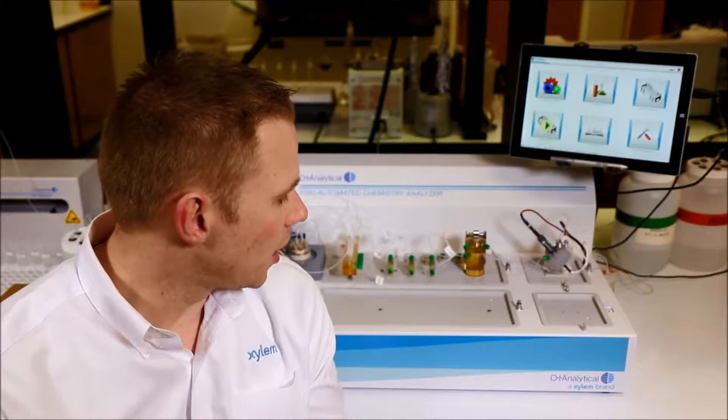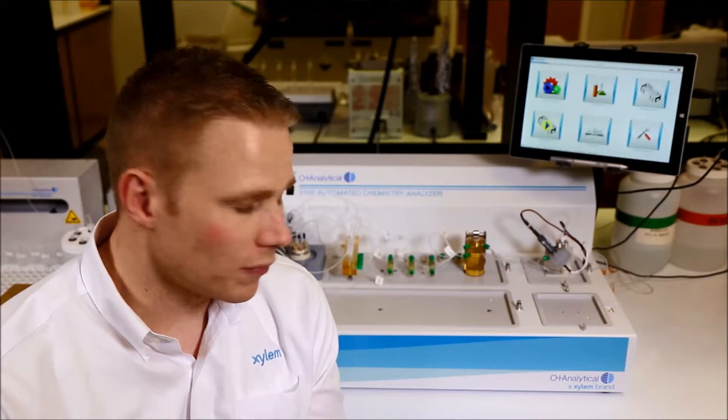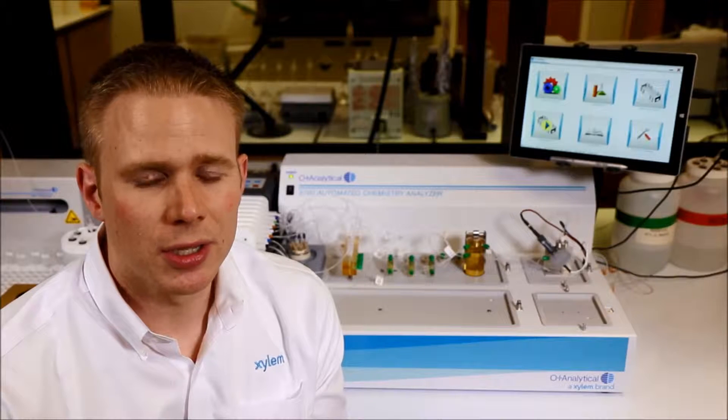So behind me is one of the methods that we're proudest of and known for, which is Total Cyanide by ASTM D7511. This is Total Cyanide with Amperometric Detection, UV Digestion and Gas Diffusion. This is EPA's gold standard when it comes to minimizing interferences and coming out with the most accurate cyanide number that you can.